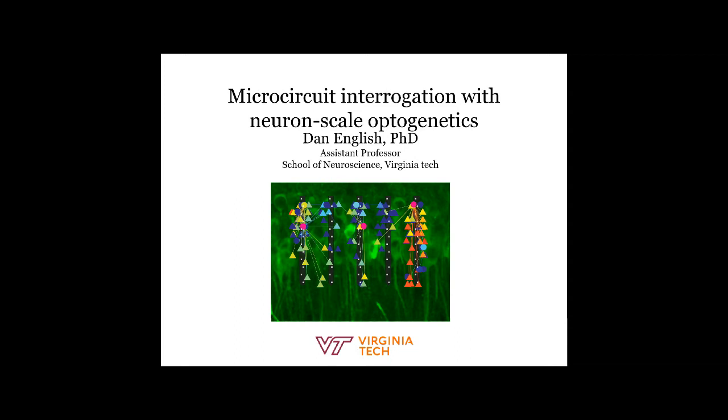I'm just going to briefly introduce the sort of behavioral tasks that we're thinking about and the kind of functions that the hippocampus is performing. And then the talk, our data, is going to be about how we use these micro LED silicon probes to interrogate the mechanisms supporting these functions.